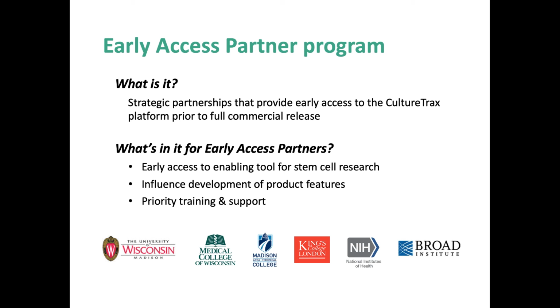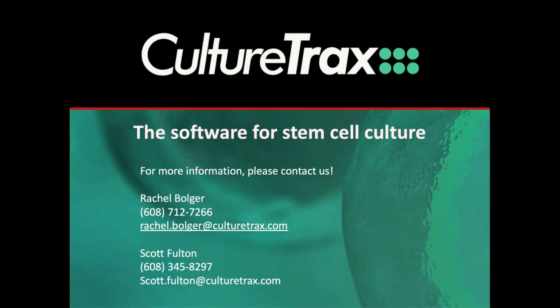What's in it for our EAPs? One, of course, is getting this enabling tool for stem cell research available as soon as possible. You'll also have extraordinary influence on the development of the coming product features, and of course we'll give you priority training and support. We hope that you'll consider joining the 9 current EAP laboratories in 6 different institutions that we have today. For more information on getting started with CultureTrax, please contact us.